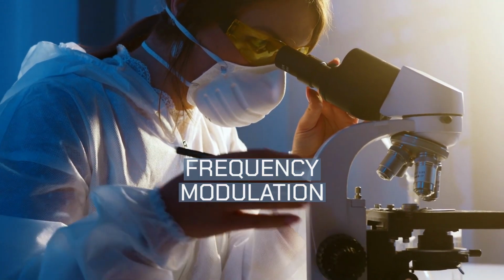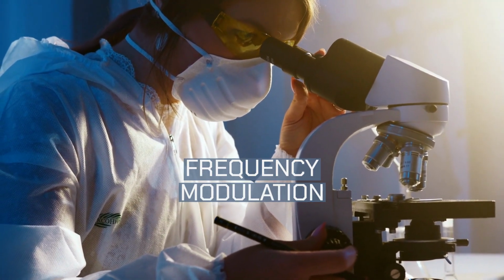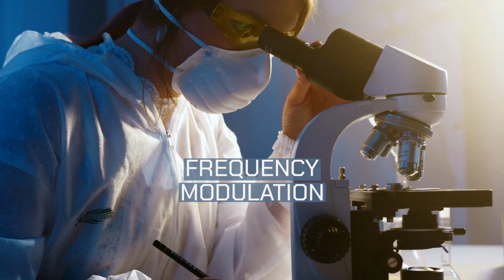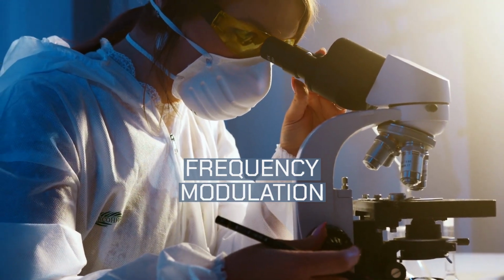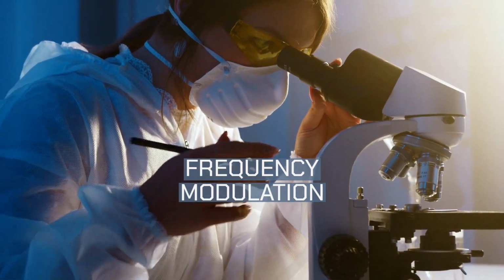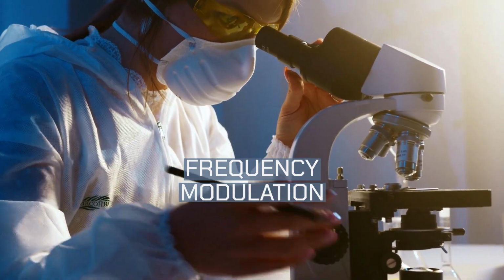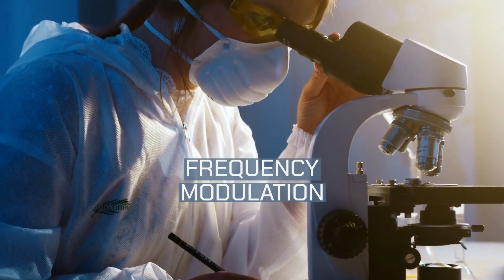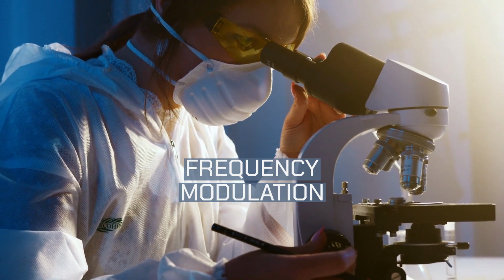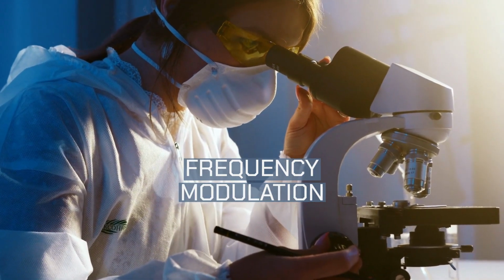The microscope can then use the change in resonant frequency as the SPM reference channel, either in feedback mode, or it can be recorded directly in constant height mode. While recording frequency modulated images, an additional feedback loop is normally used to keep the amplitude of resonance constant by adjusting the drive amplitude. By recording the drive amplitude during the scan, usually referred to as the damping channel, as the need for a high drive amplitude corresponds to more damping in the system, a complementary image is recorded showing only non-conservative forces. This allows conservative and non-conservative forces in the experiment to be separated.